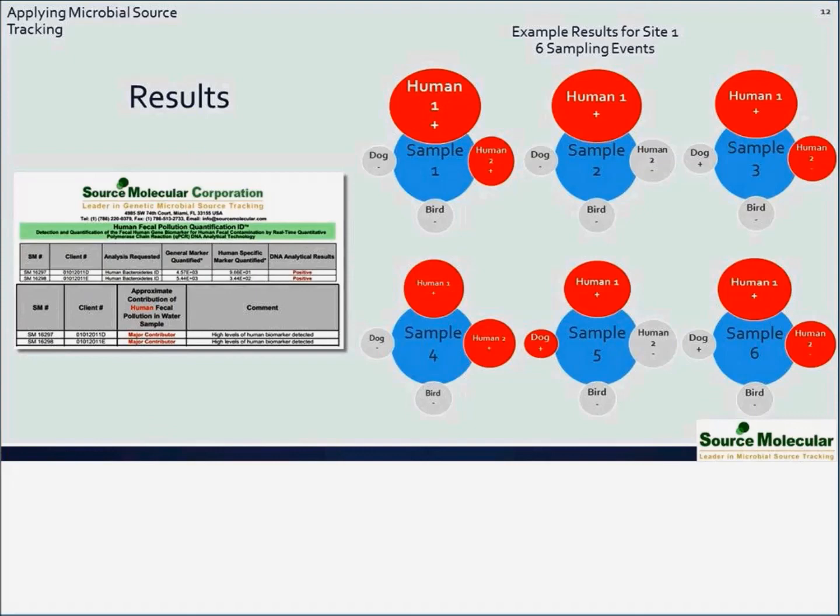And there was another question here. Do you know when the EPA will publish or approve an official method for source ID? No clue. The bureaucracy at the EPA is pretty impressive. I mean, just to get our license took a few years. To get a license and an update for the dog marker, I mean, these things take their time. It's anyone's guess. But I think the data and the submission to the bureaucracy machine should be done this year, and then how long it takes to churn something out from there is anyone's guess. But hopefully in the next year, if you want to be optimistic.